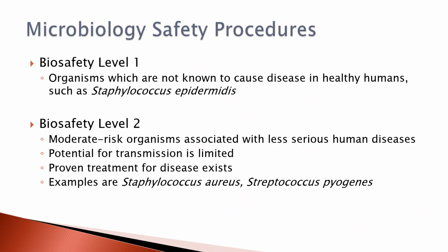A biosafety level 1 is the least restrictive. The organisms that are worked with in that lab are not known to cause any disease in healthy humans. So things like Staph epidermidis, which is all over your body right now.